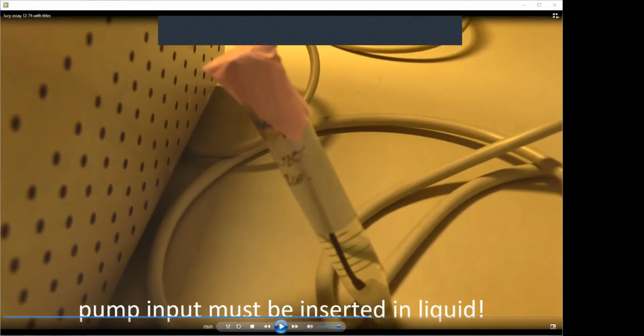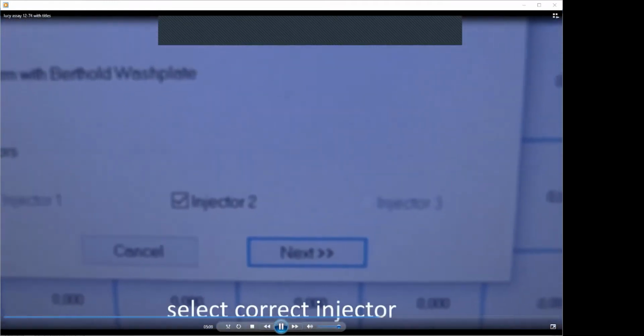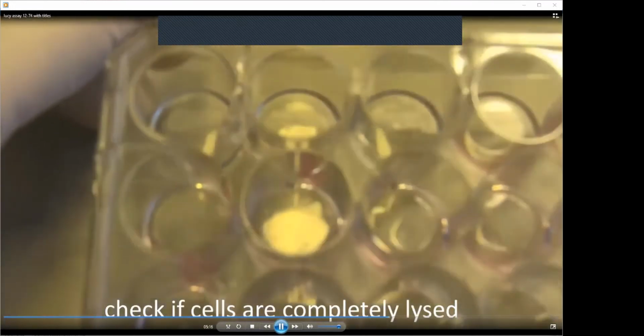Then you see here is the tubing, and this is a special filter where the solution comes in. It has to be properly inserted. I'm showing it only because of the detail that sometimes it's not properly fixed there and it sucks in air, and then the measurement doesn't work properly. So it has to be checked carefully every time. Then you have to select the injector, because these machines have several injectors. In our case, it's number 2. And we start with injecting the injection buffer, priming.